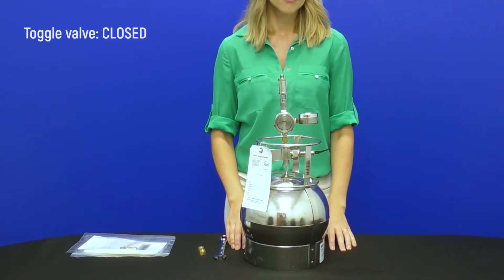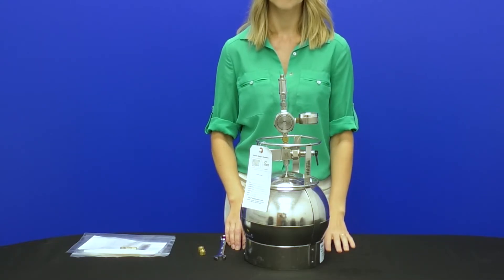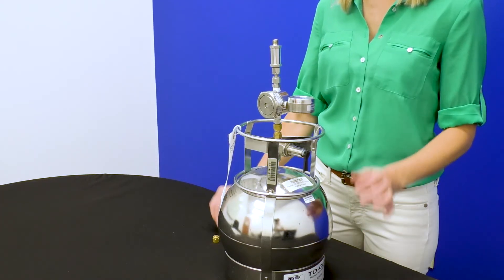When sampling is complete, close the valve. There should be a little bit of vacuum remaining so the lab can confirm that there were no leaks during return transport.